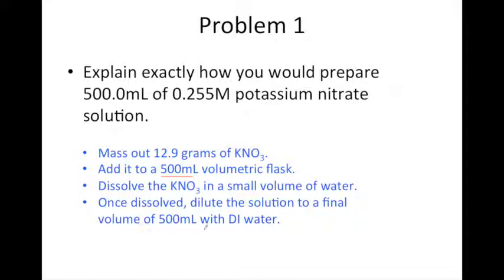So be sure that you understand how to prepare a solution, and all the steps involved in the calculations, because this is a very, very important and fundamental task for any student or scientist to be able to do properly. So good luck.